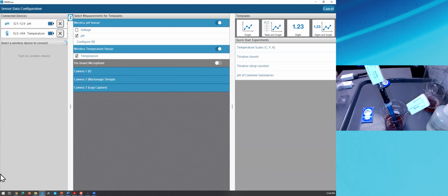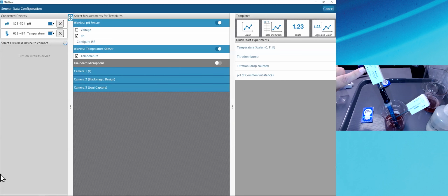All right. I didn't mention it before, but before I connected the sensors, the Bluetooth light was blinking red on the sensor case. Probably difficult to see in the video feed, but once I've connected, it begins blinking green. That's a nice way to troubleshoot so that you can make sure, is this sensor connected or not? Simply look at its Bluetooth light to see if it's blinking red or green.